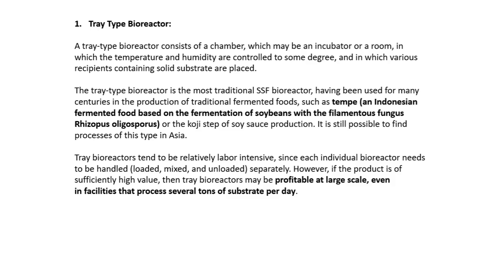For example, we can place the solid substrate on a stainless steel tray, and that is placed in a room or a chamber, which is also made of stainless steel, and to that we can pass the air. That's all. This process is very simple, very cost effective, very economical.